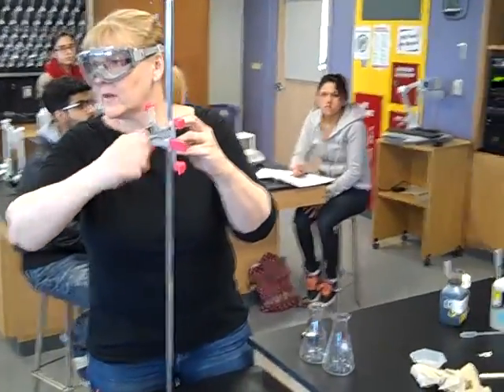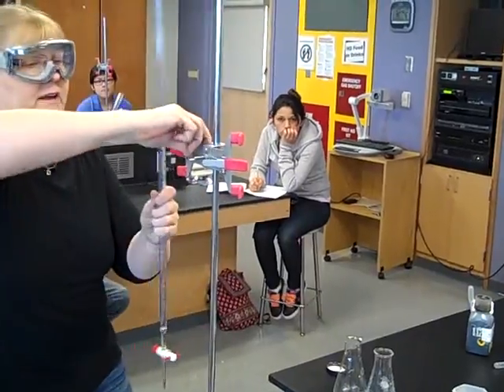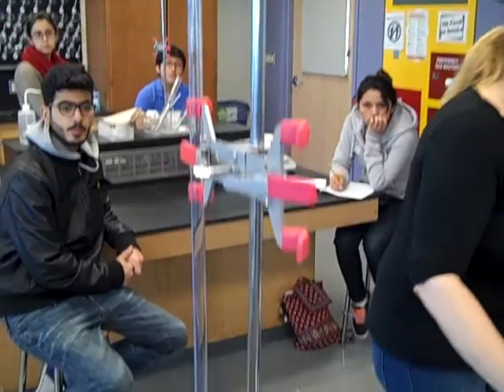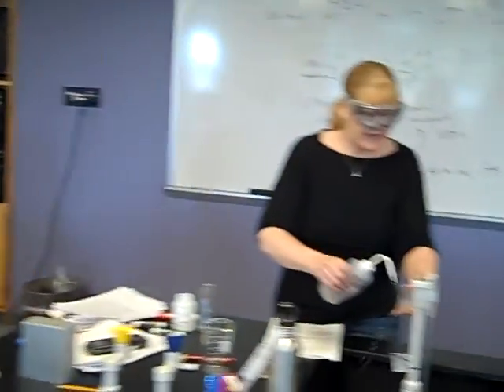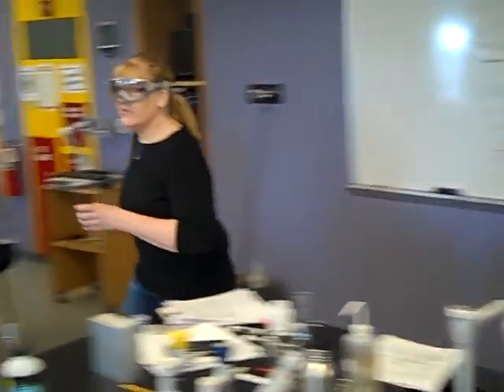The burette clamps look like this — they've got the red ends, and you will clamp your burette like this. Make sure everything is clean. Dry is not going to be doable in the lab, so just make sure it's clean. I'm going to get a funnel and clean it with deionized water. Then I'm going to get myself a container of permanganate.